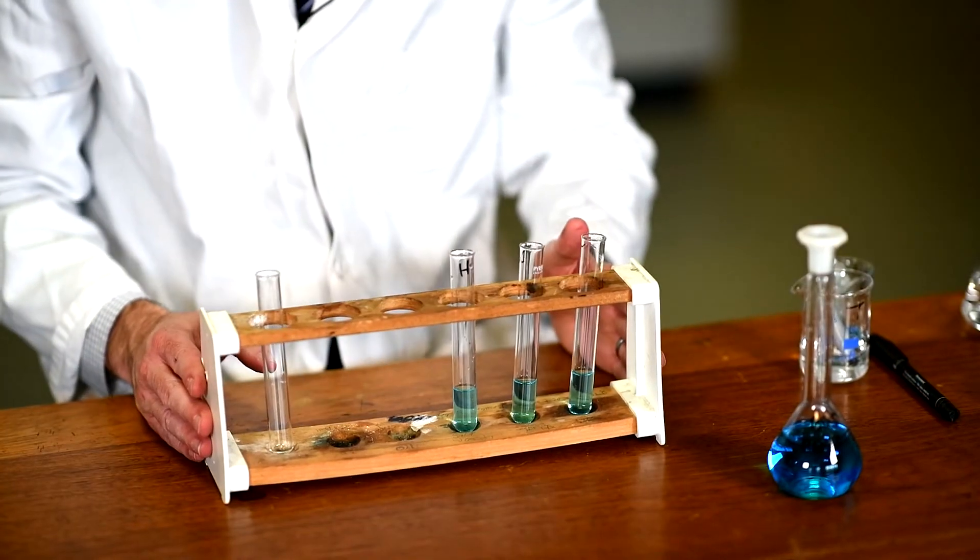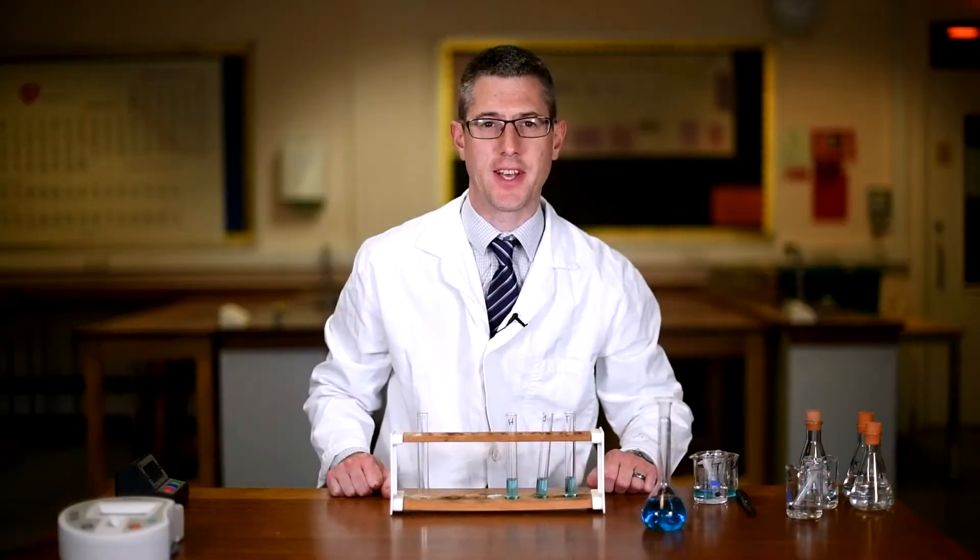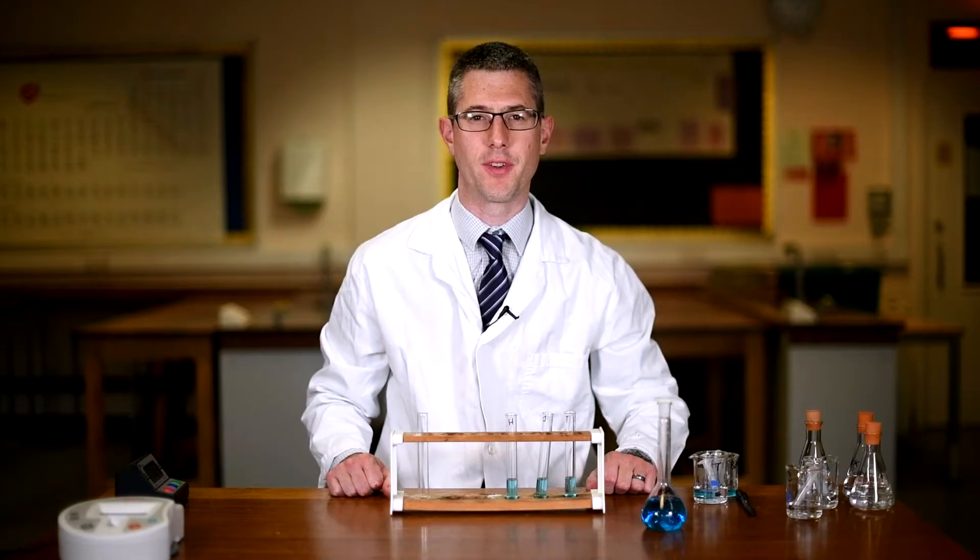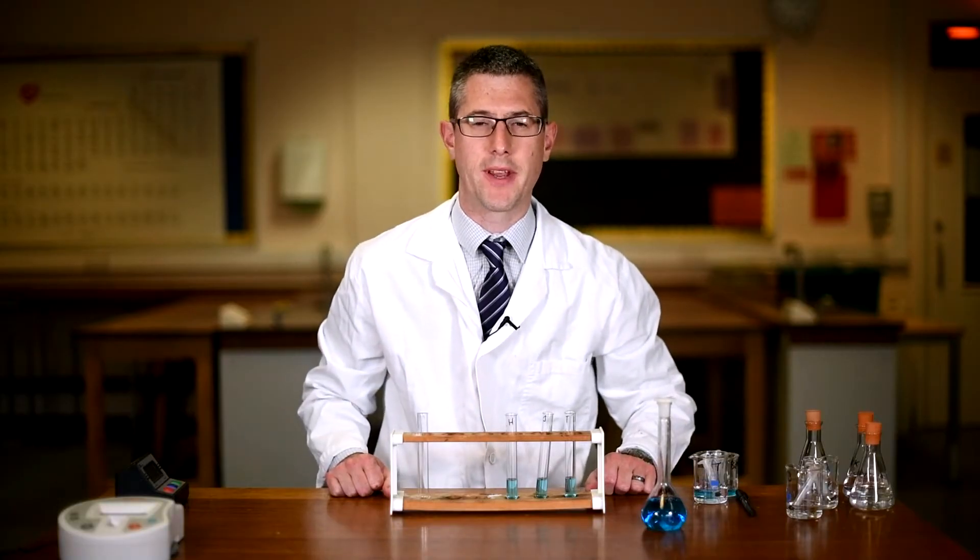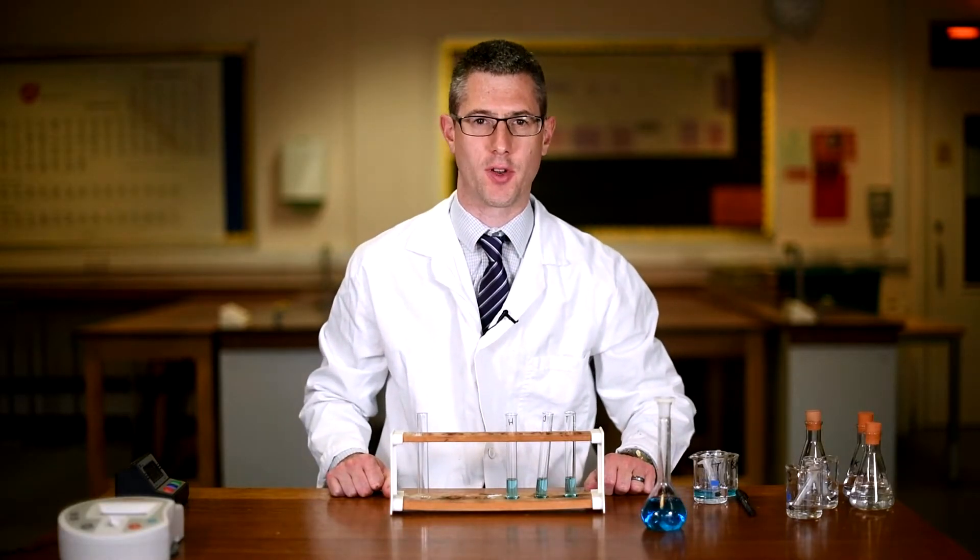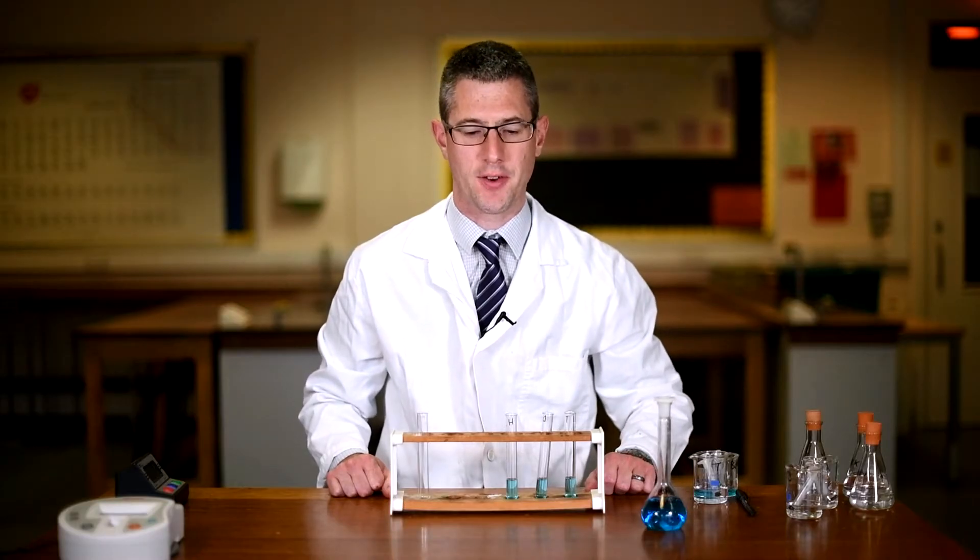As you can see, I now have my three urine samples set up. The next stage is to set up a series of known glucose concentrations, making a dilution series from a concentration of 10 millimoles of glucose. So we'll now move on to show you how to do that.